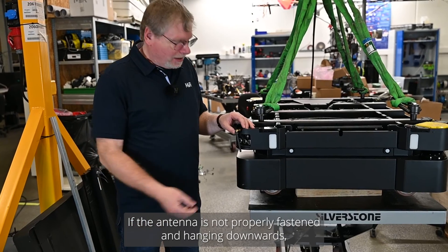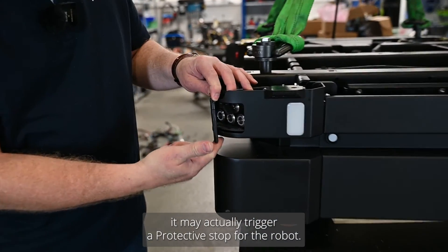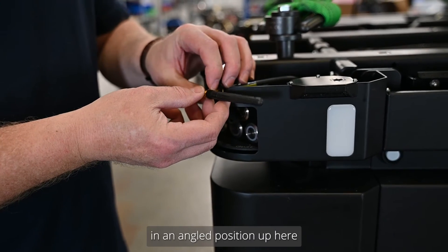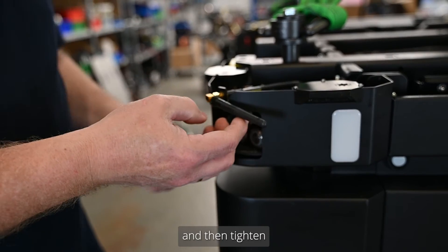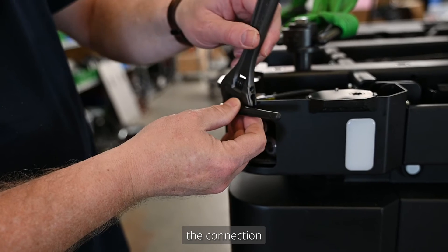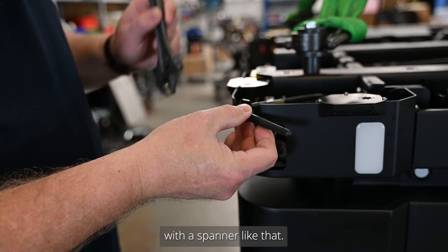If the antenna is not properly positioned and hangs straight downwards, it may actually trigger a protective stop for the robot. So ensure that it's in an angled position up here, and then tighten the connection with a spanner.